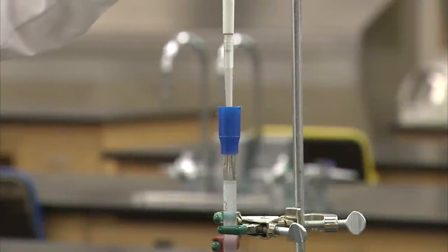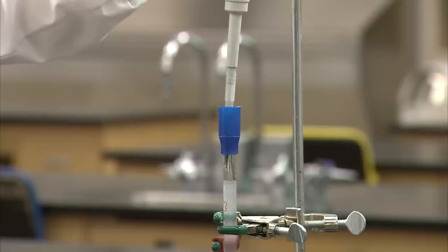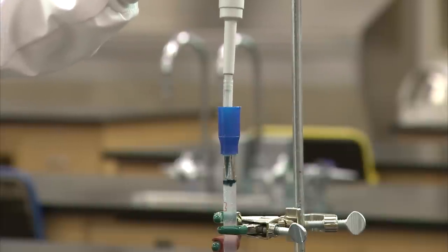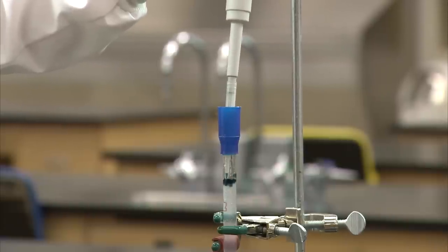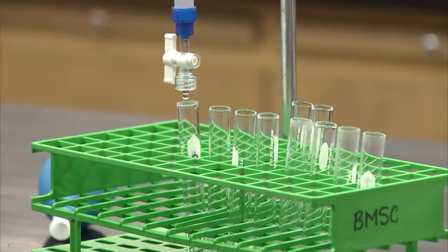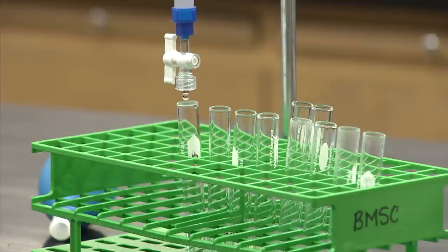In this experiment, one milliliter of a sample containing a mixture of differently sized dyes is loaded into the column. Make sure that there is no buffer above the gel bed, or this will dilute the sample. After carefully pipetting the sample into the column, you will open the stopcock and allow all the sample to enter the gel. At the same time, all the eluate should be collected for the remainder of the experiment.